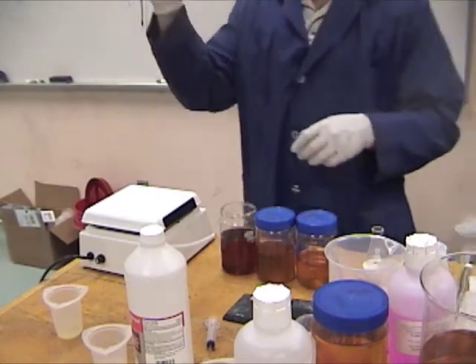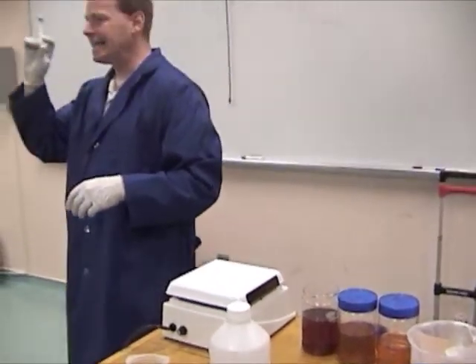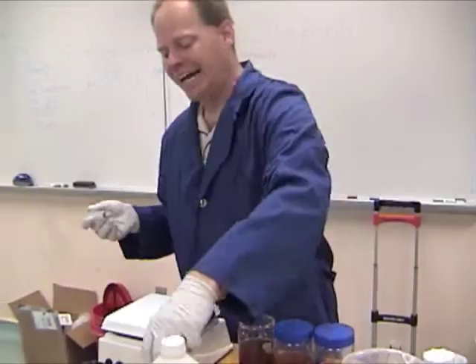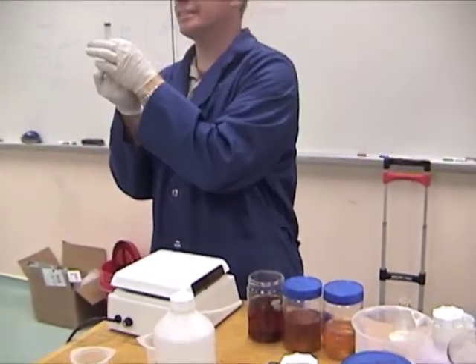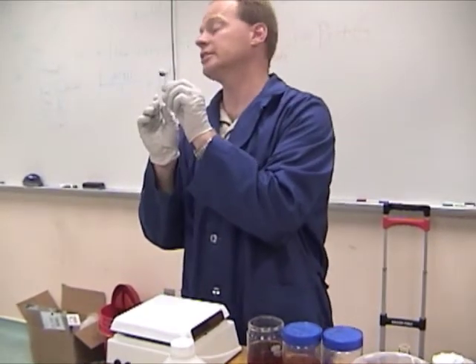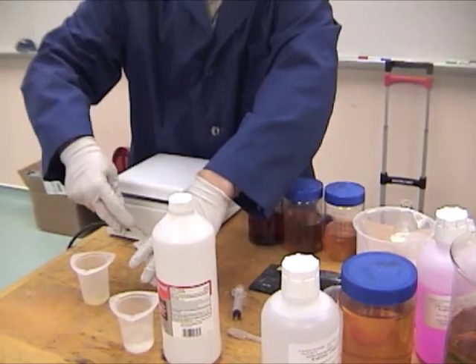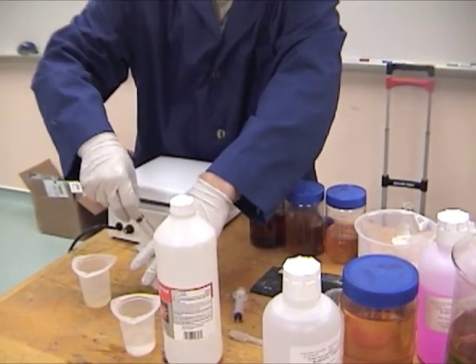Again, clean. You want it clean because you don't want any acid or base in it. You want to start with a fresh one. So I'm going to draw about 10 milliliters into this thing because it's just easy math, then I just subtract. So off I go. Ooh, I got it without a bubble. I got lucky.